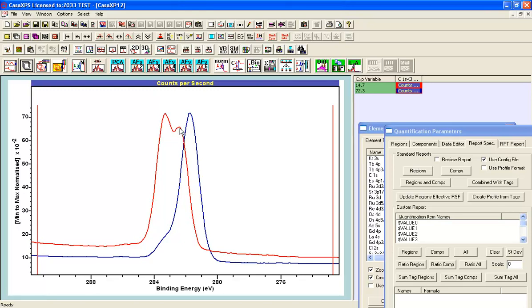Then we have another peak that is associated with polyvinyl chloride. This is carbon bonded to hydrogen, but we still have the influence of the chlorine in the carbon that was bonded to chlorine, and this second peak is a carbon that is bonded to that carbon atom bonded to chlorine, so it too is feeling some influence from the chlorine. So one might expect the binding energy to be slightly higher than you'd expect for a polymer that does not involve chlorine, just carbon and hydrogen.